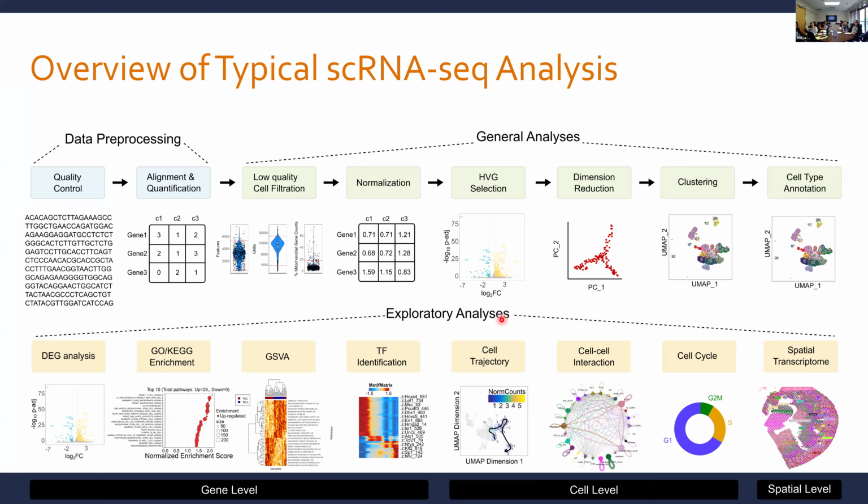A lot of these methods are exploratory in nature, in that you're just mining the data to see what is different, to allow you to create an additional hypothesis, like, this gene is really elevated in this cell type, maybe it's important for fate determination. So now I'm going to go back to the bench and see, can I knock that gene out in a study environment? So yeah, a lot of this is exploratory. And you do things like differential expression analysis, so you can compare one cluster to another to see what makes them different at the transcript level. You can do the gene set enrichment analysis we talked about, checking gene ontology terms and saying in this population, which ones are elevated or under enriched.